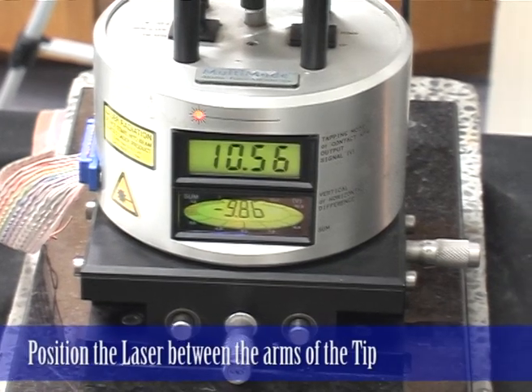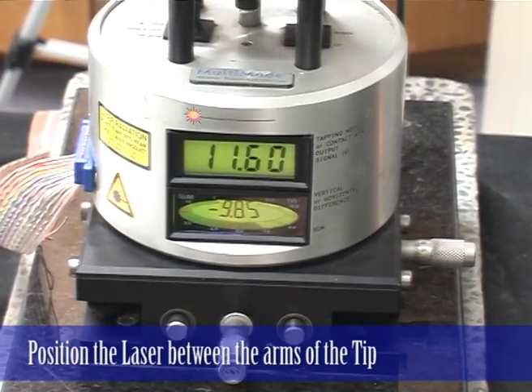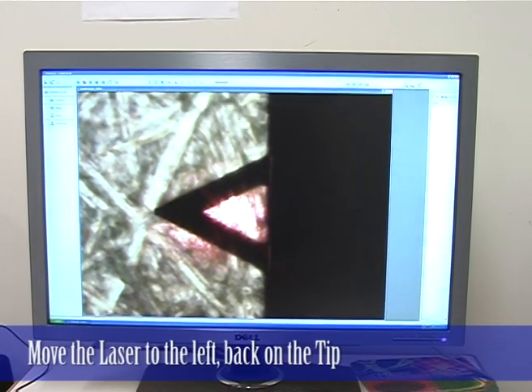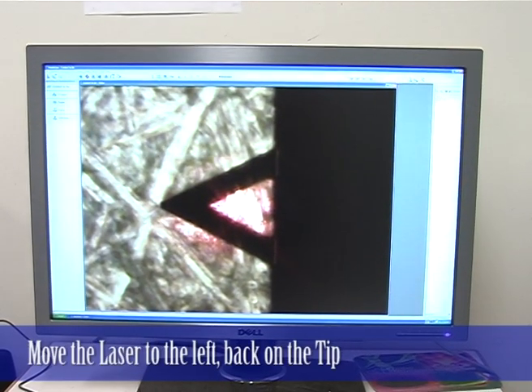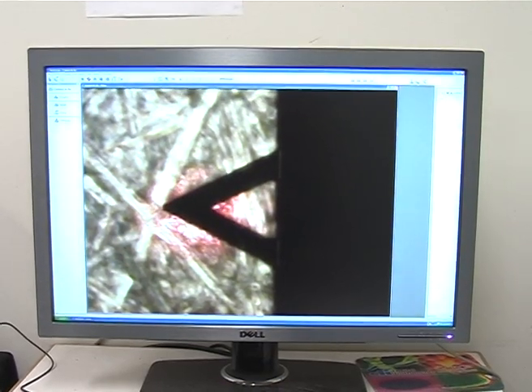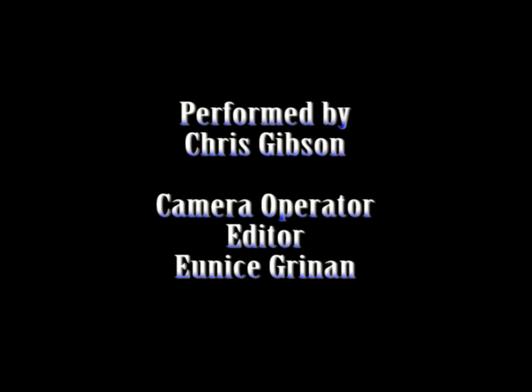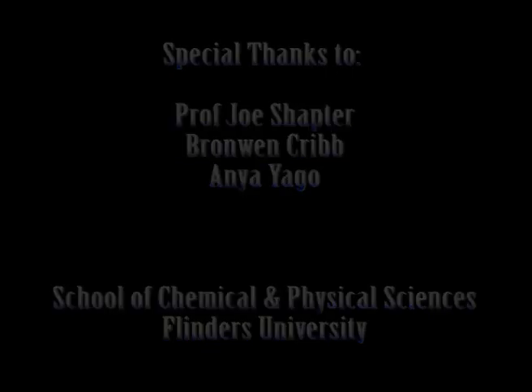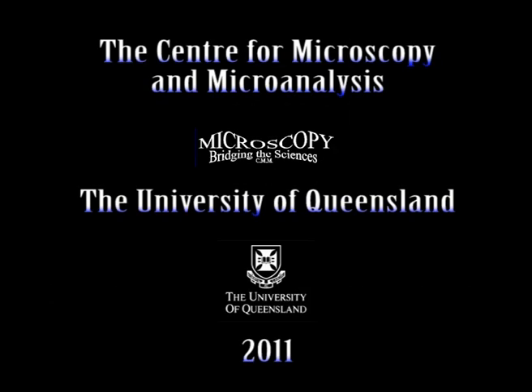So you know, you've got poor alignment. One thing you could do of course, is when you're in between the arms, at about that position, you could then bring it left. So there you go.